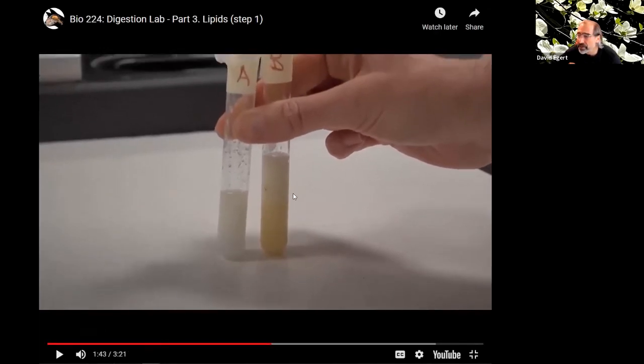You can already see the bile is kind of orangey, brownish, yellowish. That's a little darker color just because of the bile salts. You can't tell from being in Zoom, but it's also kind of stinkier. Bile doesn't smell so good. You can also see there's a lot of foam and froth, right? These are basically like detergents. This is when you're trying to cut the grease and soap things down.